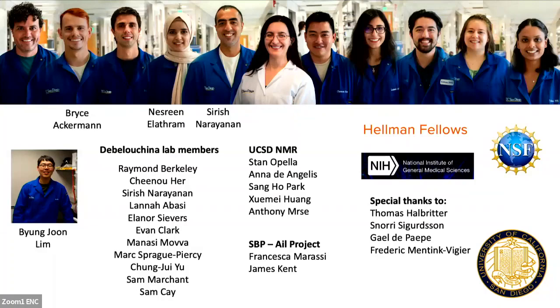We are currently doing experiments with intact cells. And the struggle there, just like Kendra has shown, is having good protocols to not kill your cells and let all of these components come out and reduce your polarization agents prematurely. But sometimes, yeah, if you keep things outside on the membrane, there's not much reduction.